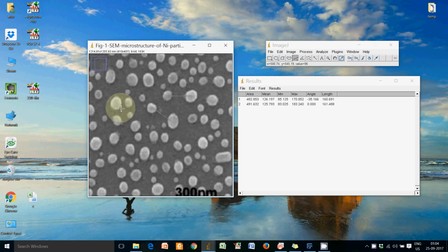Let's do it for some more times. Draw a straight line, Ctrl M and Ctrl F. Third line appears. Do it once more: Ctrl M, Ctrl F. Do another one: Ctrl M, Ctrl F.